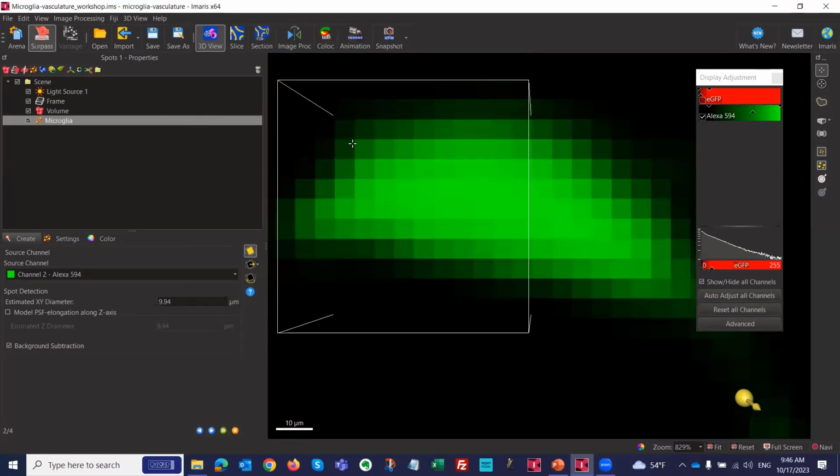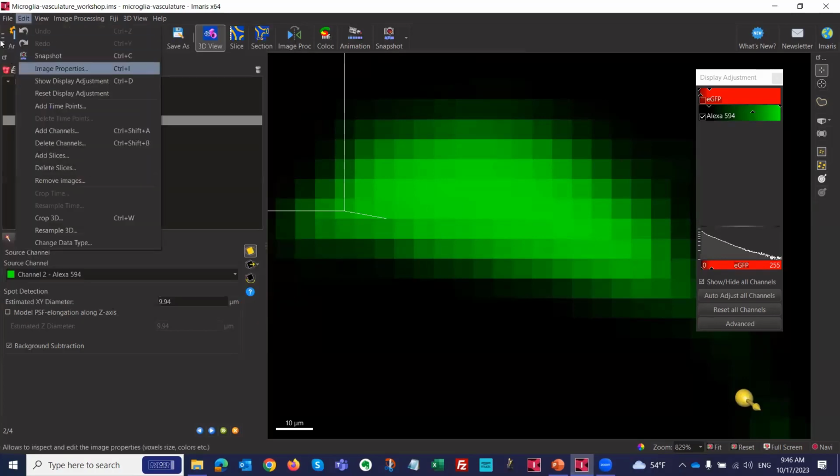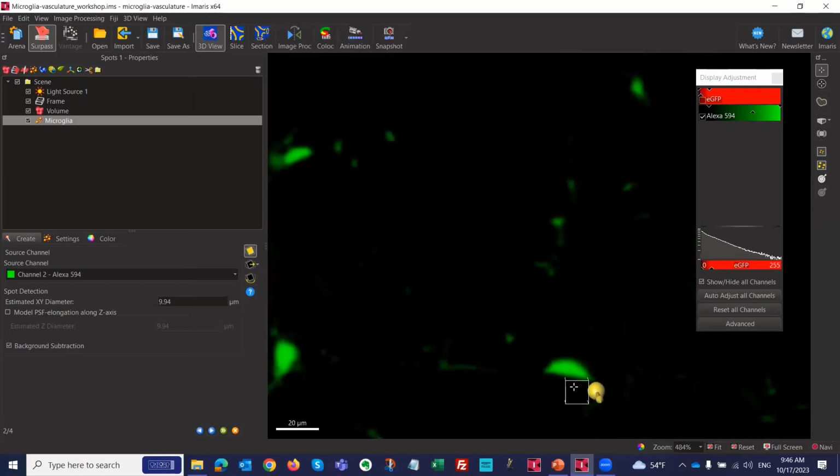And this is your actual data, because everything is based on the pixels that you get. It's just for visualization. For all the analysis and everything, we're using the real pixel data. But most people like the smoothing because it gives a cleaner look for the result.